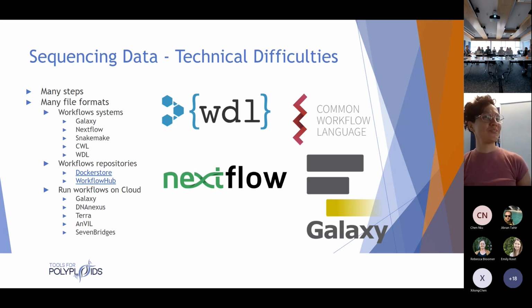We will do it in the terminal, because I think most of us have access to HPC instead of cloud services. And for the HPC, if you ask your IT people, there's also a server version of Cromwell, the workflow manager, that allows you to just press buttons, submit the workflow and submit the inputs. But we will do the hard way, okay?